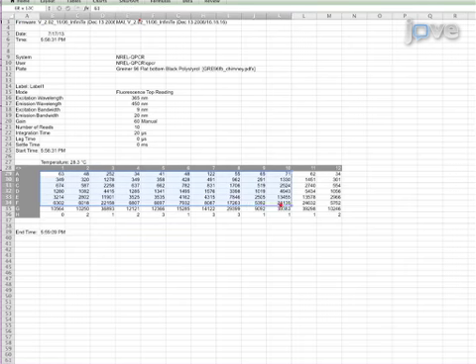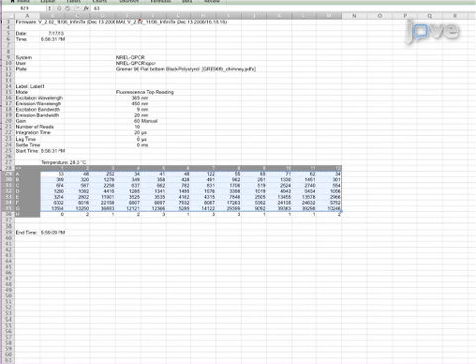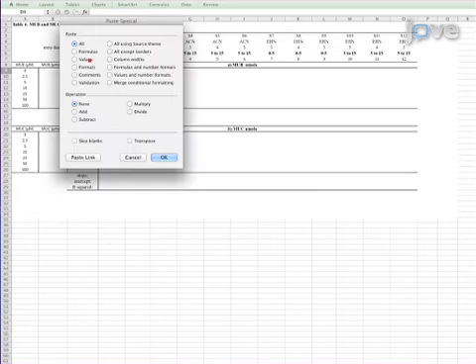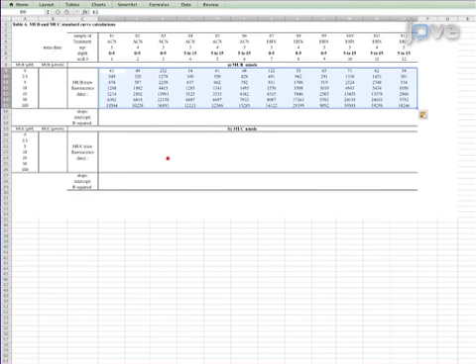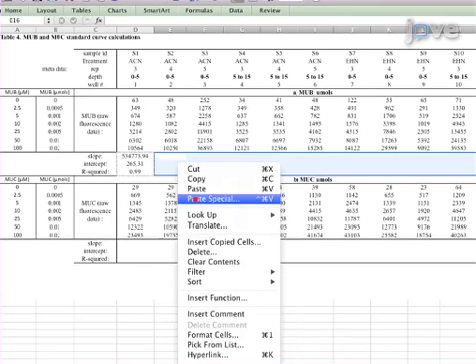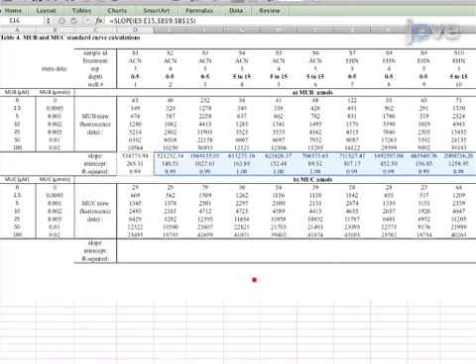Begin data analysis by entering standard curve fluorescence data into a spreadsheet for the MUB and MUC standard. Convert the micromolar concentrations to micromoles. For each sample's standard curve fluorescence data, calculate the slope, y-intercept, and r-squared values for MUB and MUC standard concentrations. Acceptable r-squared values should exceed 0.98 for each sample.